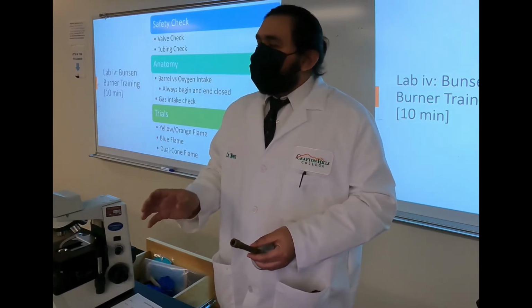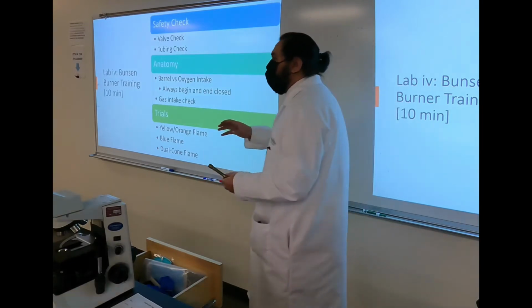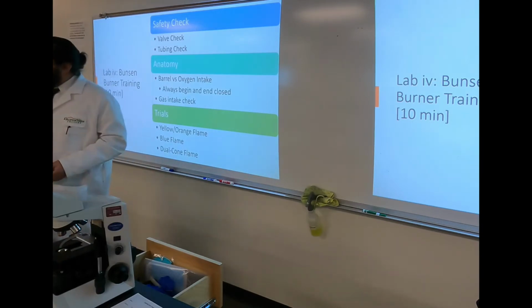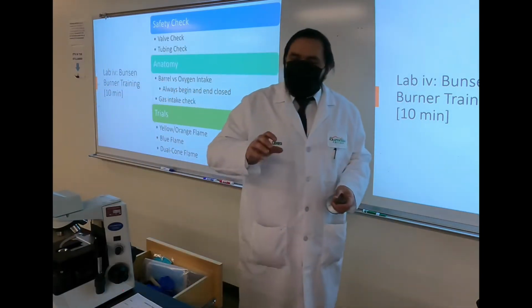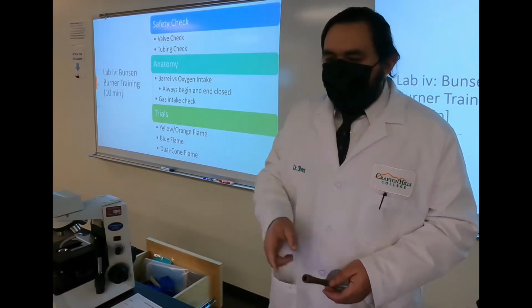And so the first thing you should do after you disinfect your stuff is always check your gas valve. So in front of you, you'll see there's a valve that has this blue little cap, might say gas, might say not, but it's a blue cap. Always just get into the habit of just kind of going, it's closed, right? You don't have to go all crazy, you don't have to go all Herculean and hulkish on it. Just make sure it's nice and tight and good to go. That's gonna be part 1.